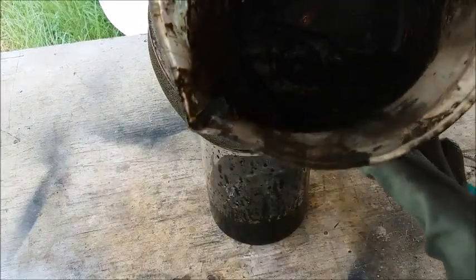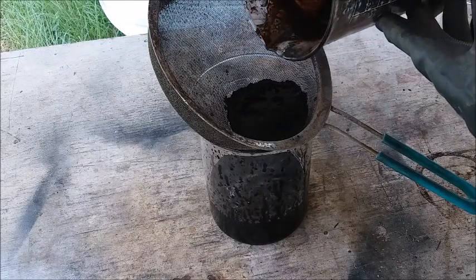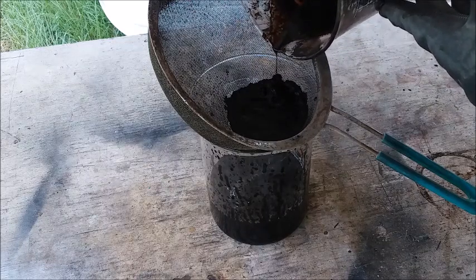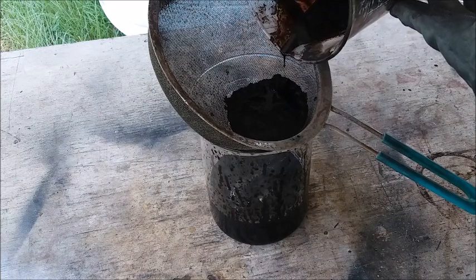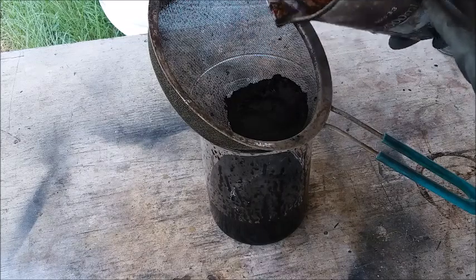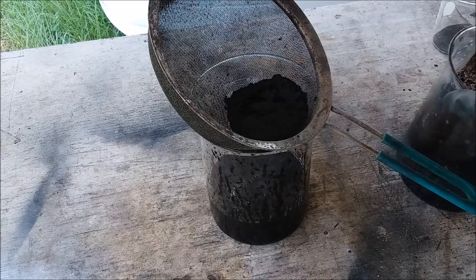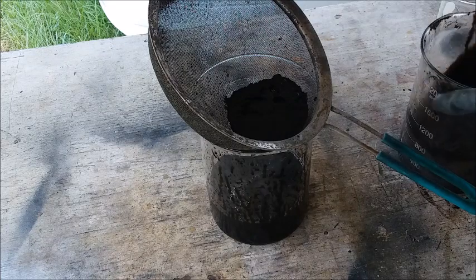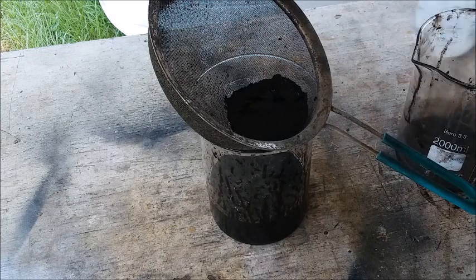Well, kind of hard to tell what's in there, isn't it? Gotta be careful washing this stuff too, because it's still mostly sulfuric acid in there. Adding water to acid is the wrong way to go about things. But on the other hand, it's the only way to see what's going on. So it's a little bit tricky. Alright. I've got a bottle of tap water here. What I'm going to do is spritz a little bit in, keeping my head well clear. It's going to get hot. It could easily start boiling and popping.